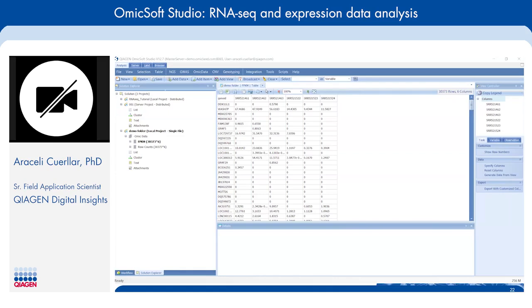You can also group your samples by any metadata that you provided. For our case, we're just going to use none, but you can see how the metadata can be very useful to help organize your analysis. And then lastly, just select the name of the output. So I'm just going to go PCA plot.